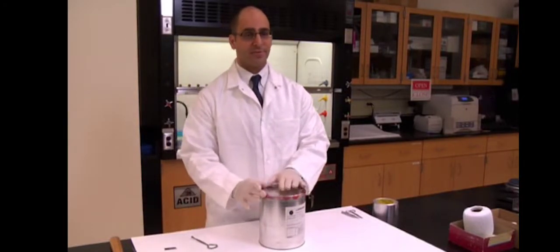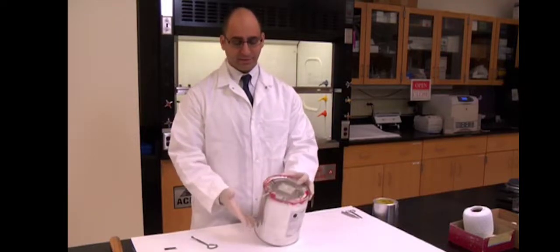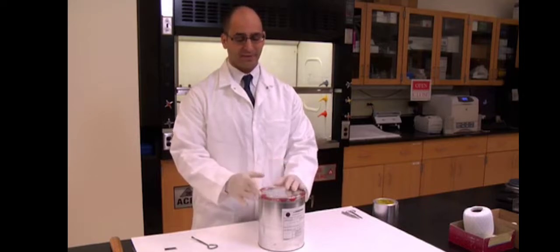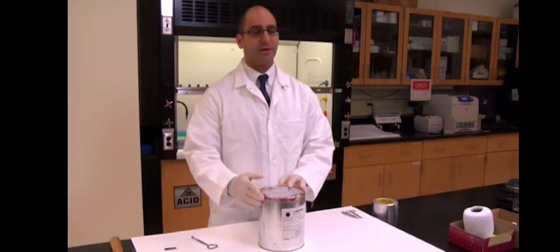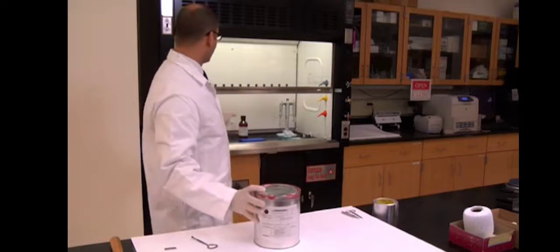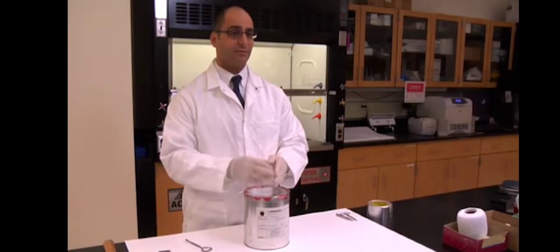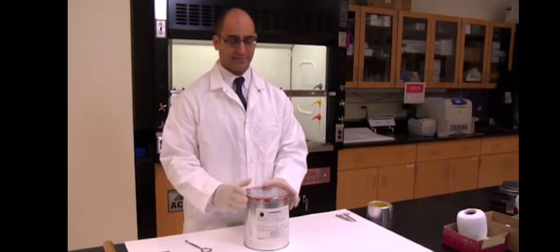That's why we put the carbon strip in the can. Carbon is very good at adsorbing organic compounds. So any volatile compounds that are in the can that go into that headspace will deposit on that carbon strip and concentrate on that strip. So it's inherently more sensitive than the heated headspace technique. Once we're done heating with that carbon strip, we can take the carbon strip out of the can, bring it over to our hood, and elute it with a suitable solvent. Any organic compounds that deposited on that carbon strip would then go into that solvent, which we can then use to introduce into our gas chromatograph mass spectrometer for analysis.